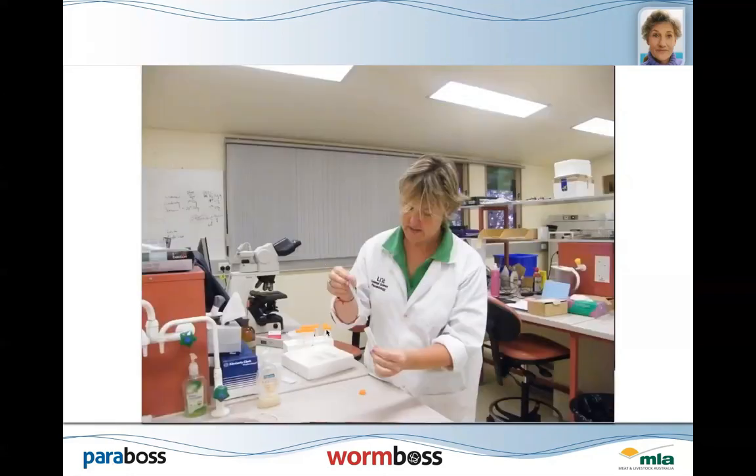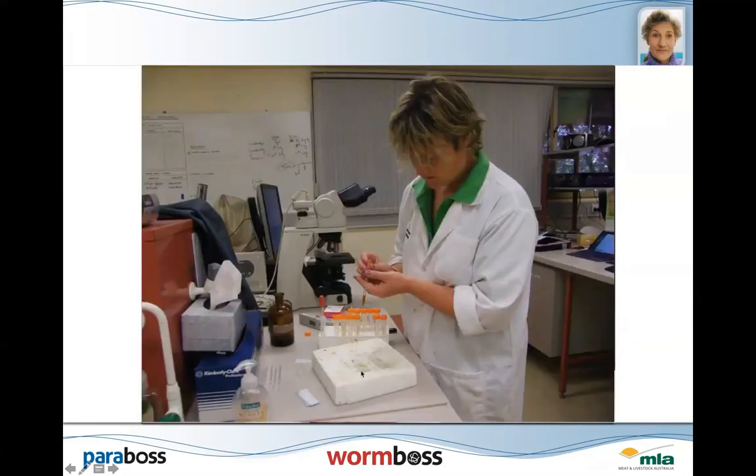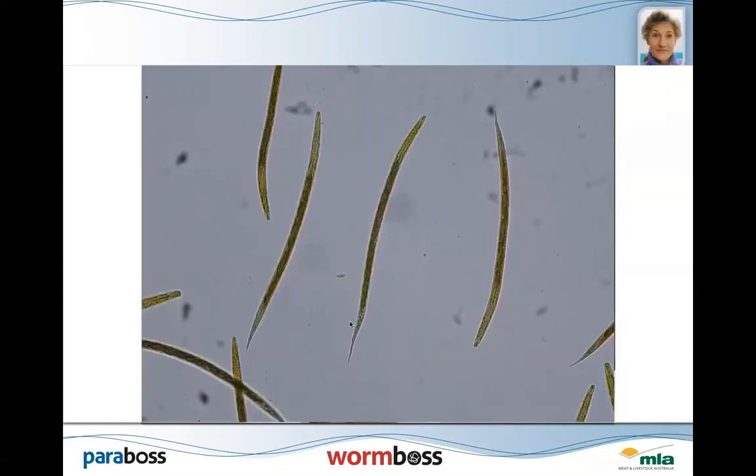Now, just use a pipette, take out the larvae from the bottom, put it onto a slide here, then you use some iodine to stain it, pop it under the microscope, have a counter here to have a look which worm larvae they actually are, and then have a look at the larvae.